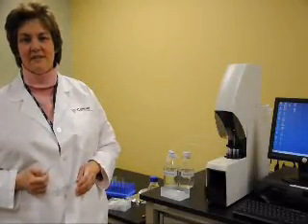Hi, I'm Lynn Jordan from Caliper Life Sciences. I'm here today to talk about Caliper's Rapid Trace SPE workstation.